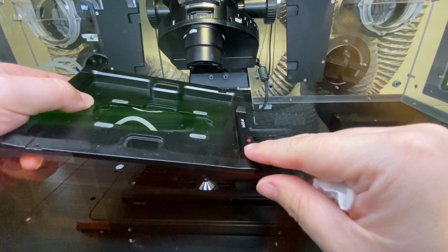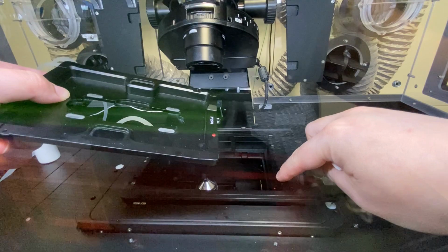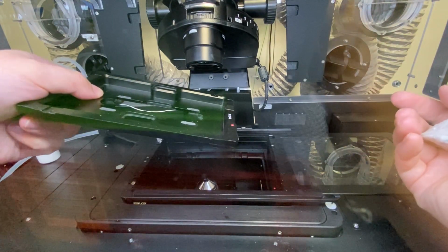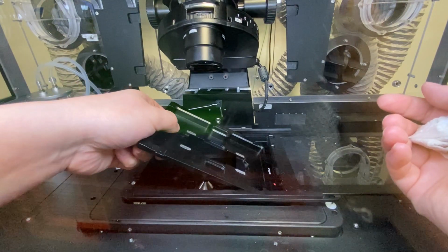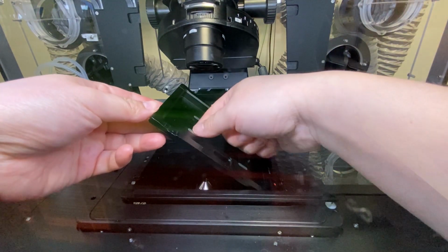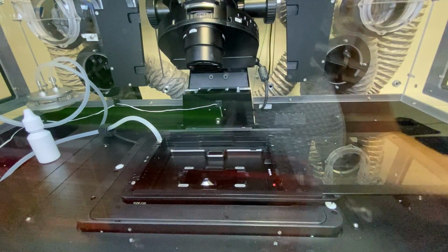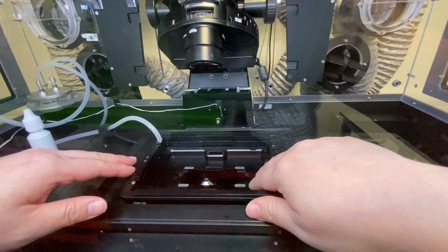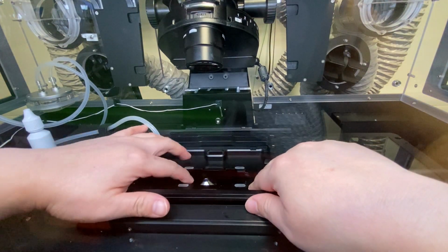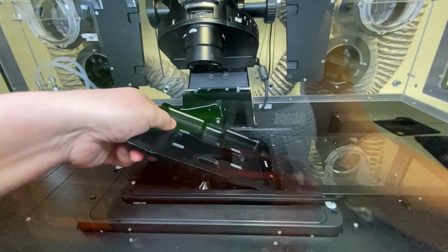To place this in, you need to line up the red dot with the red dot over here. Everything is magnetic, so at an angle, it should just slot in quite easily. And then hook your finger in the middle and gently lower this down. To remove the slide holder, you want to rest your hand on one side, pull with the other, and remove it at the same angle.